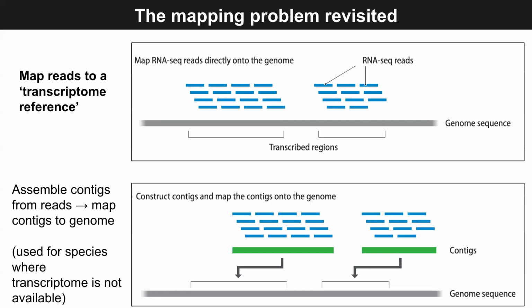Why? Because I know which isoforms should exist, but I haven't quantified them. I haven't looked at that. When I was doing the alignment, I was only looking at the gene coordinates. So I know where exactly that read went, right? Just to give you an example, this is gene 1. Its isoform 1 looks like this. Its isoform 2 looks like this. And its isoform 3, this is slightly an extreme scenario, but this is what it looks like. So when you do the alignment, you have a choice. You say, okay, is my read falling in these boundaries?